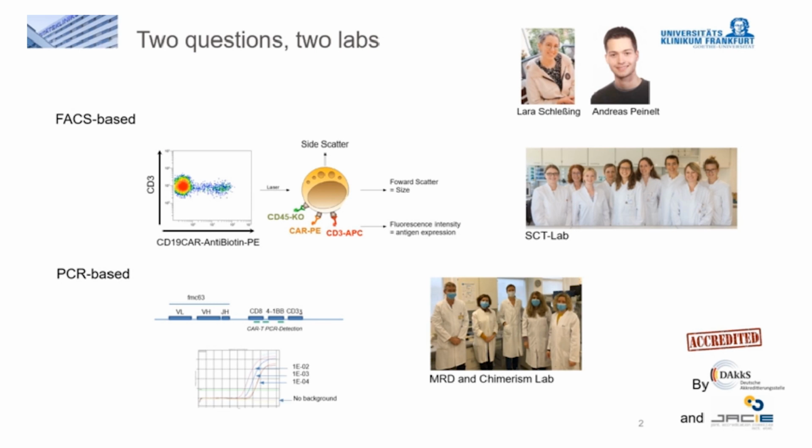So there are two possibilities to monitor CAR T-cell expansion in vivo, by flow cytometry and by PCR. With flow cytometry, the measurement will take 2 to 3 hours. The detection limit refers to approximately 0.5 cells per microliter, and one benefit is the quite fast result, whereas the PCR will take a bit longer with the main advantage of the little lower detection limit.